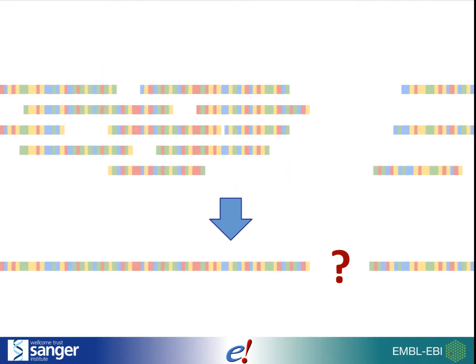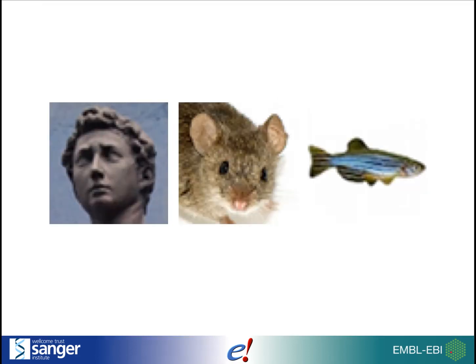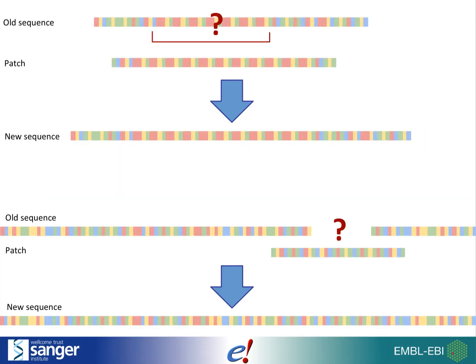Gaps in the assembly can occur where regions were not sequenced. For popular species, such as human, mouse and zebrafish, new assemblies are released periodically. This means that the problem areas, such as gaps or poorly assembled regions, can be repaired.